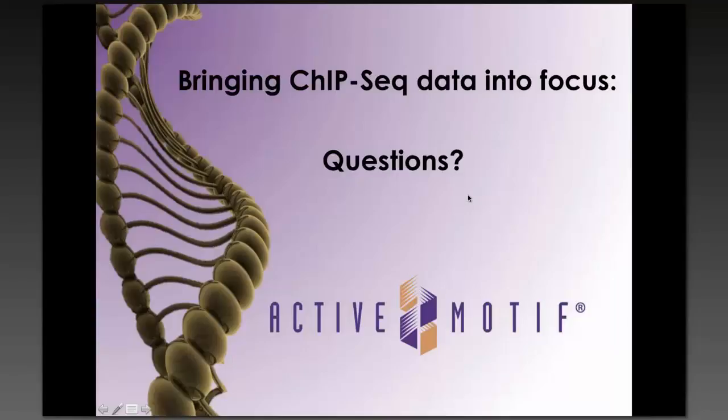Does the spike-in result vary depending on the antibody used to pull down the Drosophila spike-in, i.e. how specific to H2AV are the H3K27 results? We've only used H2AV as the spike-in antibody. If we use that antibody, the question is, can you find another antibody that's specific to Drosophila, and would it change the spike-in results? No, I don't think so. If you could find another protein, present in Drosophila and specific for Drosophila, you could do it with a different antibody.